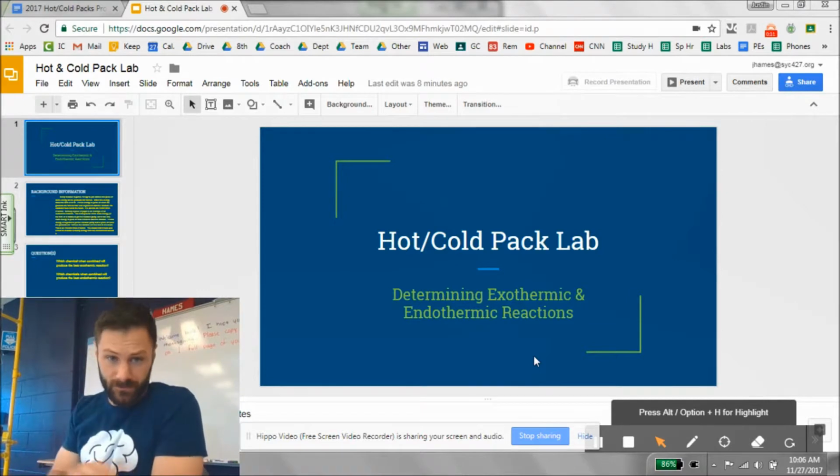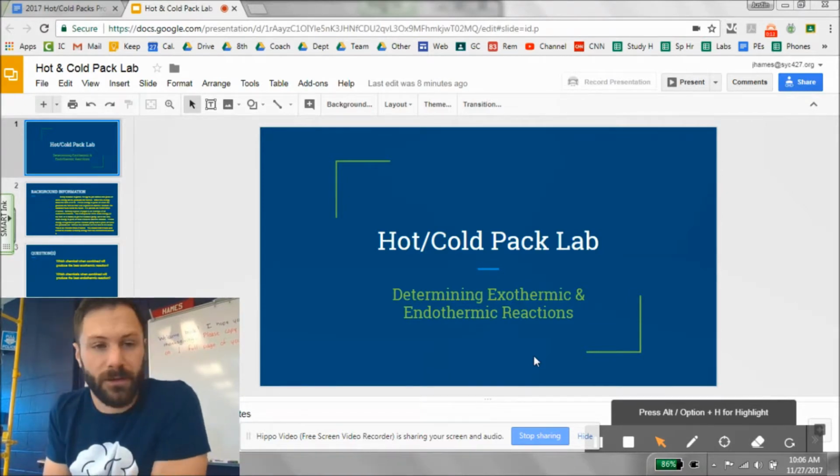Today we're going to do a hot and cold pack lab. So if you're not here, if you're still on vacation, or you maybe got sick from eating too much turkey, here is what we're doing today so you can follow along.